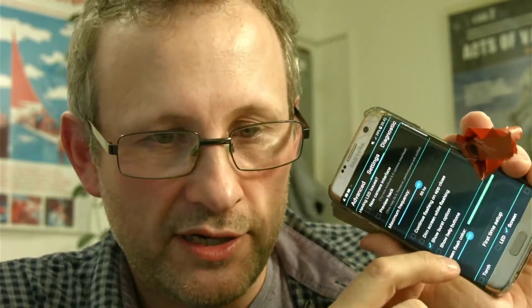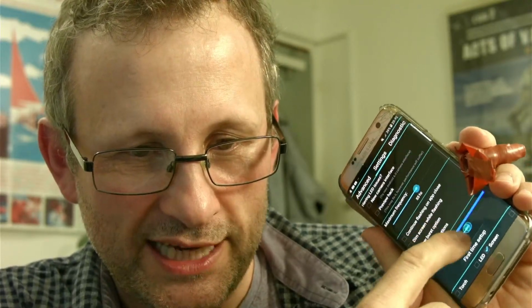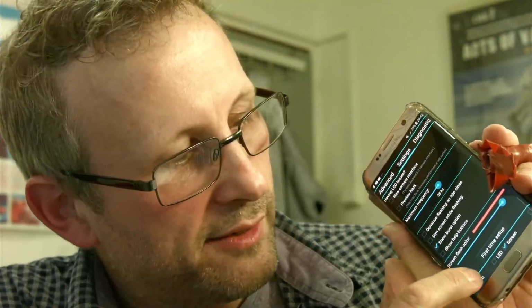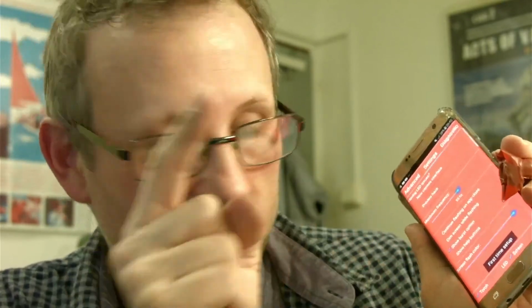However, when I was thinking about my problem with my LEDs not working today, I thought, this software allows you, and I don't know if you can see this, you can actually choose a color here. Rather than making the backlight strobe, you can actually choose a color. So let's say we choose over here, this is a red in theory, and I press this one, it'll make the back screen of that, and it's actually a lot redder than it looks on this camera because it's saturating out and making it look more white because I've got the brightness turned up. Anyway, so we're going to be using that.